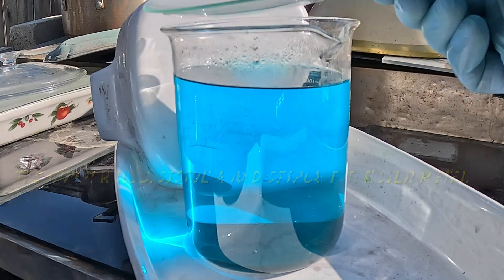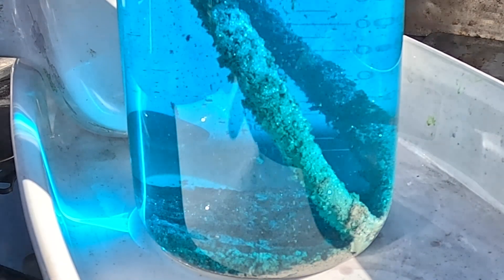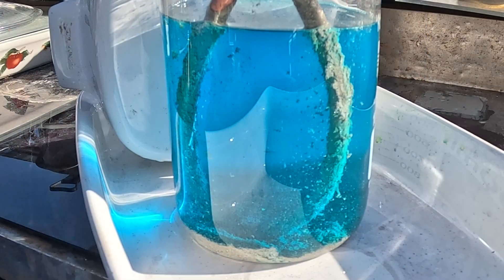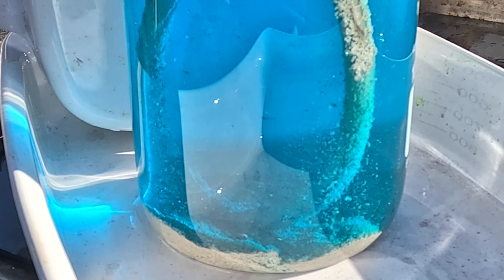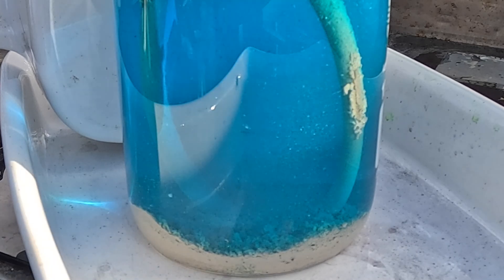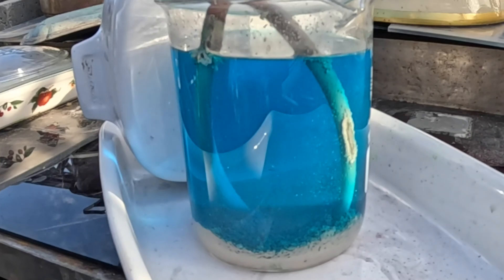We're going to drop the silver like nobody's business here. Starting to get a little pile — about half an inch on the bottom now. Still oozing some out. Got about maybe a little over a half inch, three quarters of an inch in some spots. It's still falling — that's going to be too long of a video.